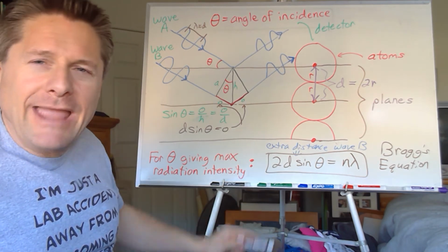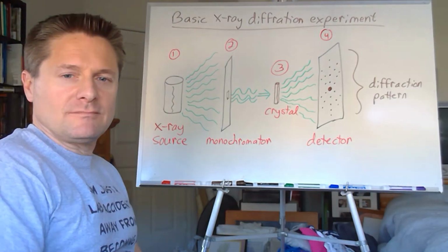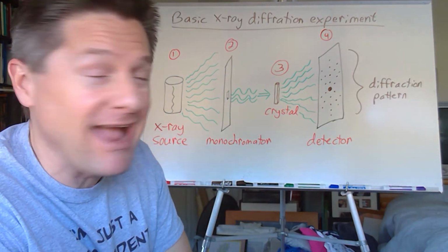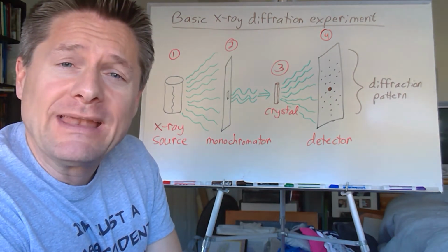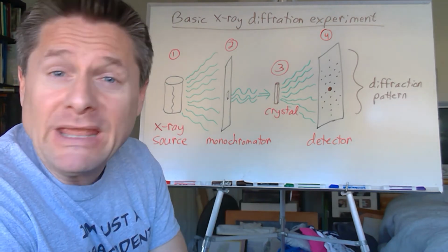But let's take a look at a basic X-ray diffraction setup. Not a lot of details, but a basic setup. Here's a very rudimentary look at the components of X-ray diffraction. Nothing fancy, but there are probably little 2, 3, 4 minute videos. If you're really interested, you could pop through. I was watching a few, just on Bing or something like that.